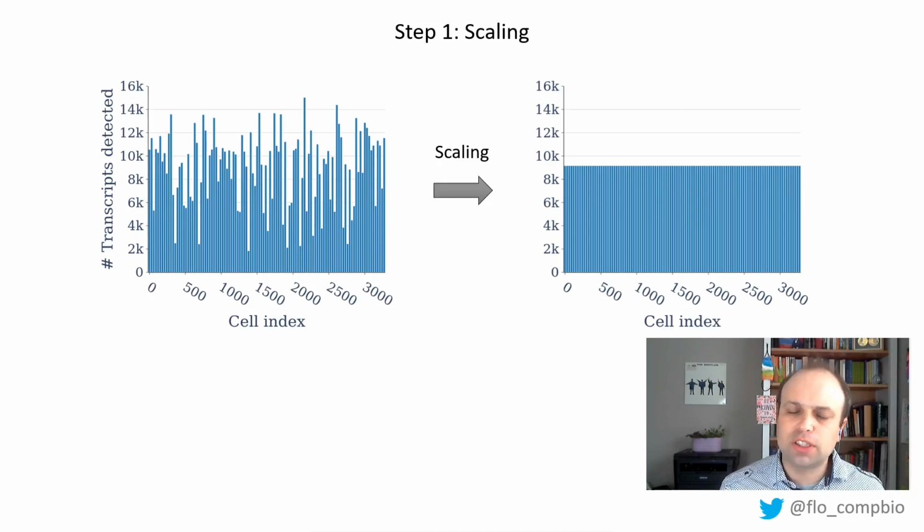But we're often not interested in comparing these absolute transcript counts because they are different for different sized cells. Instead, we want to compare concentrations. So that's essentially what you do here. You convert these UMI counts to concentrations. So if you scaled everything to 10,000, now you would have the measurements as how many transcripts are detected per 10,000 transcripts, independently of which cell type you're talking about. And that's often much more useful than comparing absolute counts.